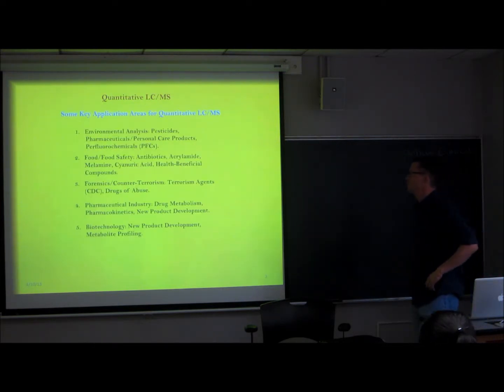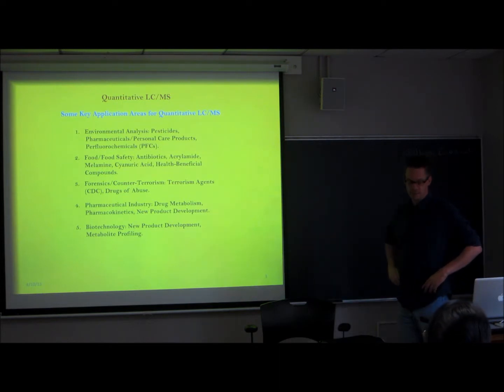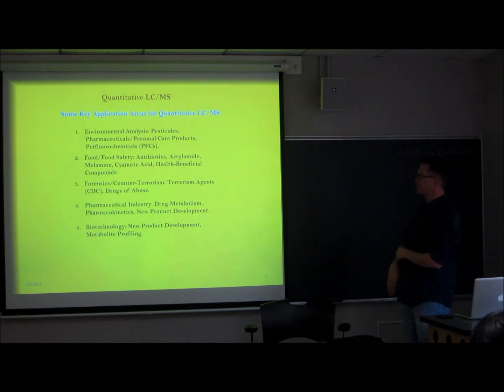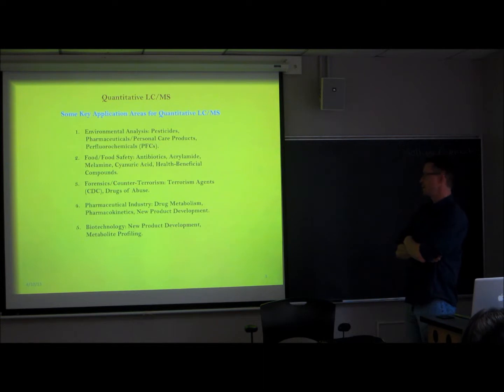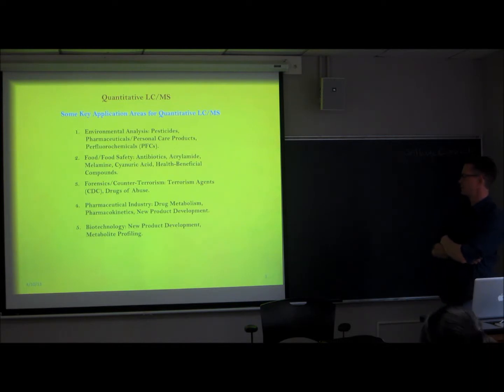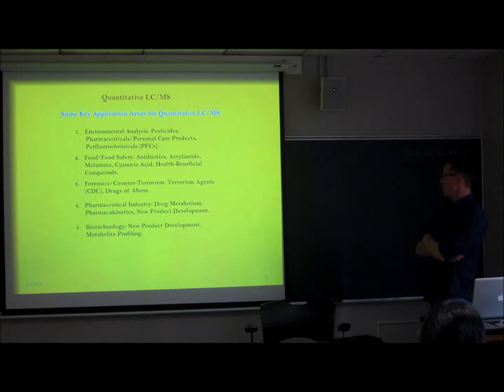Key application areas right up front for doing quantitative LCMS. If you gain experience in this, it's a very marketable skill. There are employers everywhere looking for people with LCMS experience, especially people who understand how to do quantitation in complex mixtures. It's an enabling technology in environmental analysis where you're doing pesticide screens, looking at pharmaceuticals or personal care products, perfluorochemicals in the environment, sampling river water and lake water and streams, and looking at the environmental impact of a variety of compounds. GCMS and LCMS are going to be your two enabling technologies in that area.